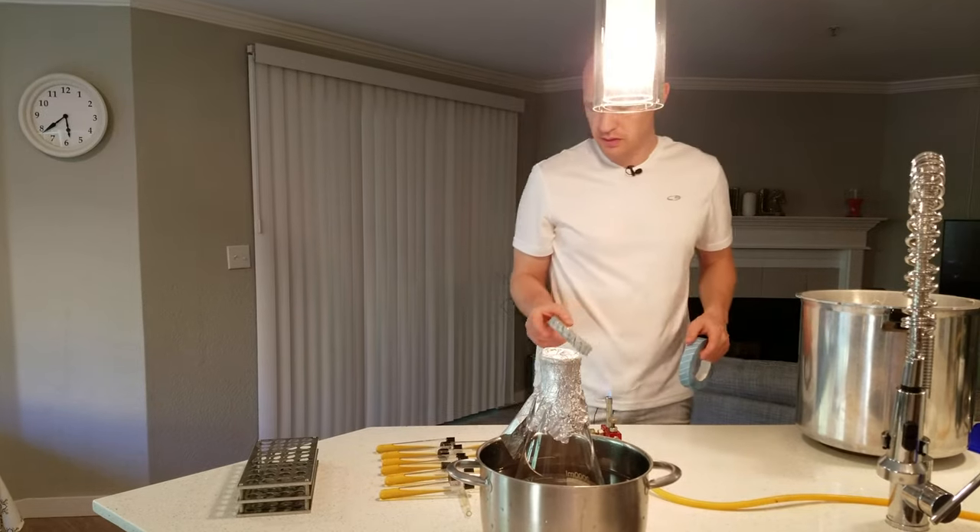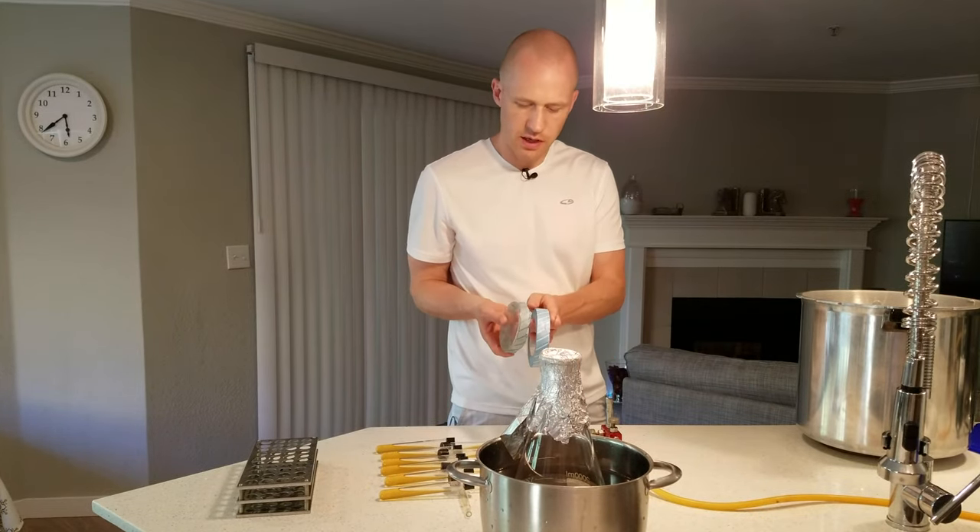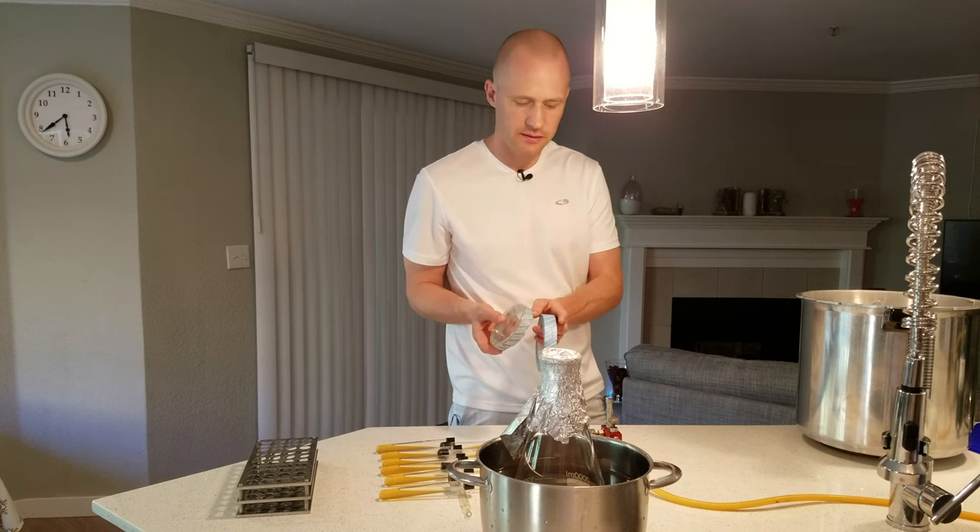You can see the one plate that I put the tape on — it's now become black, indicating that it was sterilized.